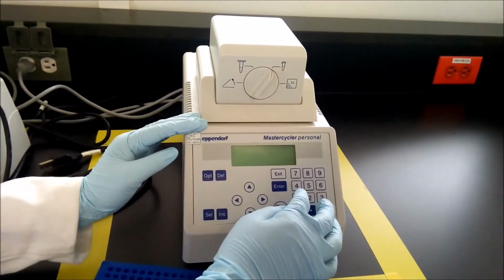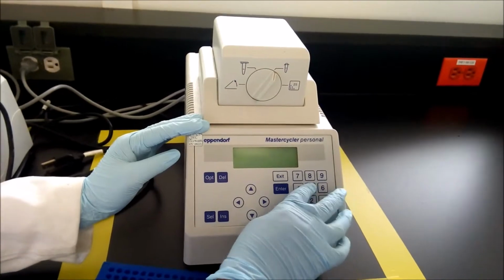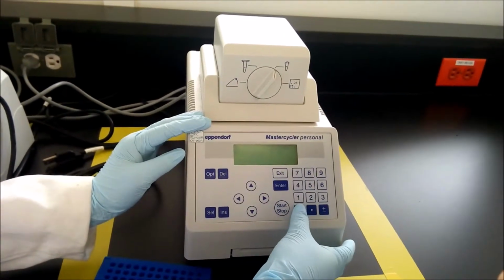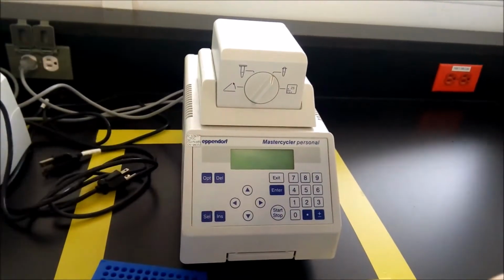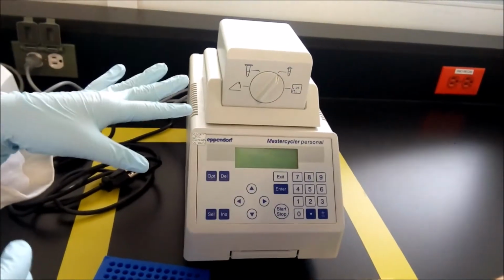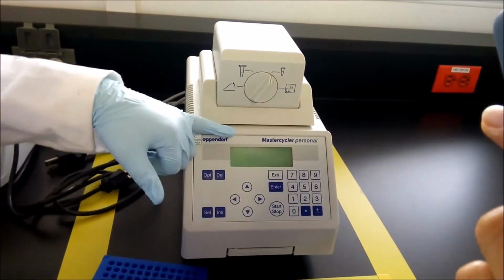It is left at 72 degrees Celsius for 5 minutes to finish any partial amplification. And finally, a temperature of 4 degrees Celsius is programmed for an indefinite time to maintain the integrity of the products obtained.